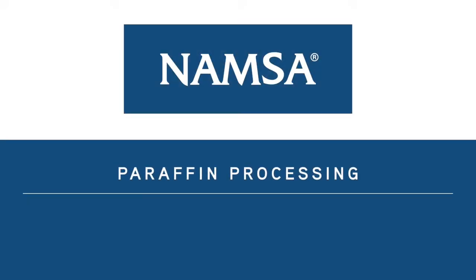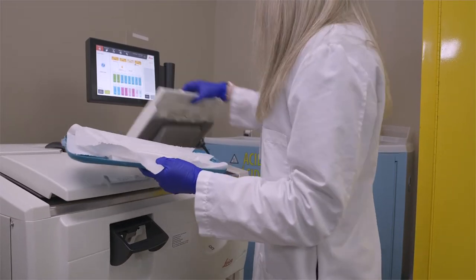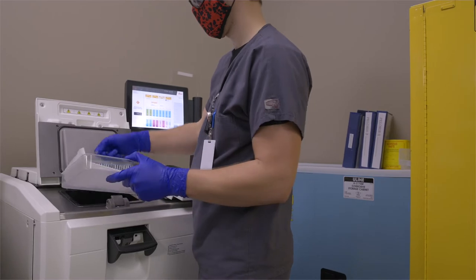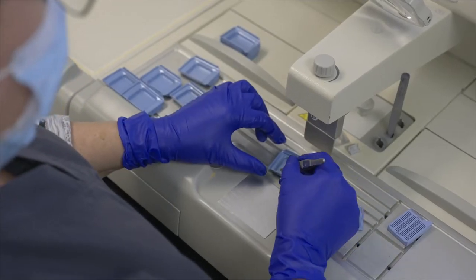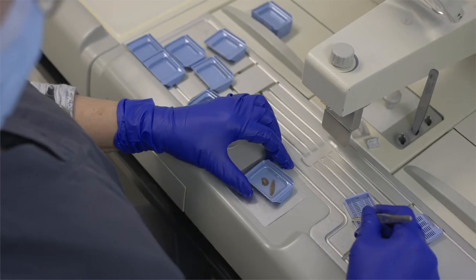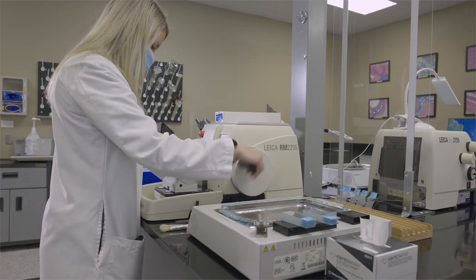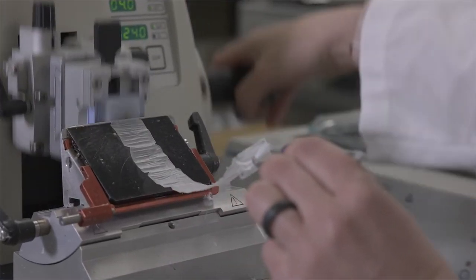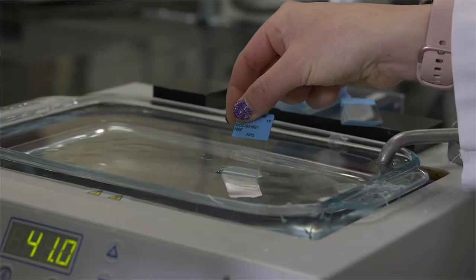Let's take a look at the paraffin workflow first. Paraffin processing is fully automated on a tissue processor and takes between 5 and 24 hours depending on the size of the tissue sample. An embedding mold is chosen and the tissue is embedded in paraffin wax. The paraffin block is cut on a microtome using a disposable blade at a thickness of 4 to 6 microns, which is 10 times thinner than the width of a human hair.